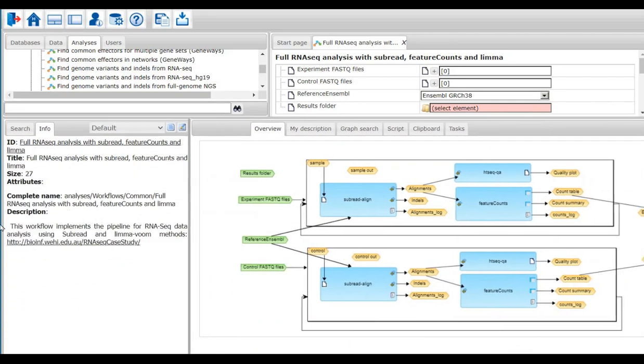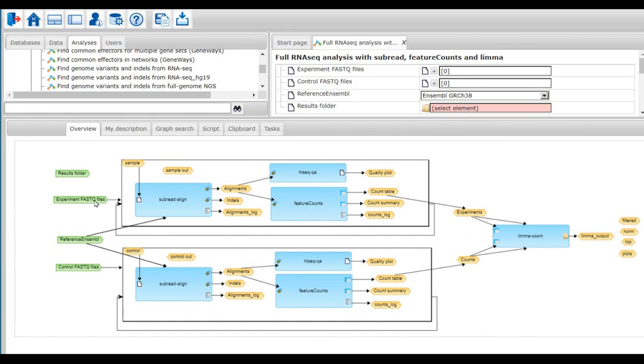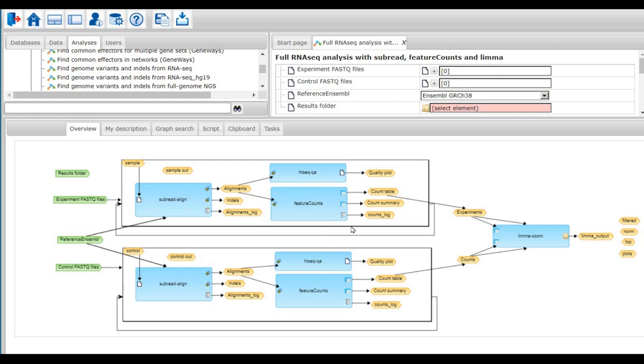As shown here, this workflow consists of two major blocks: experiment or condition 1 and control or condition 2. Each block consists of subread align method to map the RNA-seq reads on the reference genome and feature counts to count the number of reads. Each block runs in circles so many times as the number of input FASTAQ files. Finally, the calculated counts for condition 1 and condition 2 are subjected to the limma-voom method to calculate the log fold change and p-value.